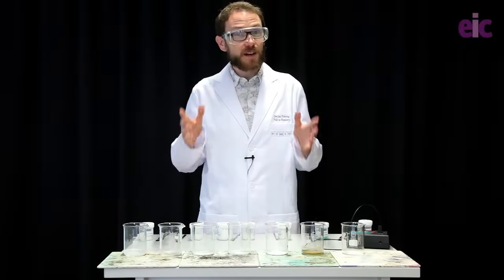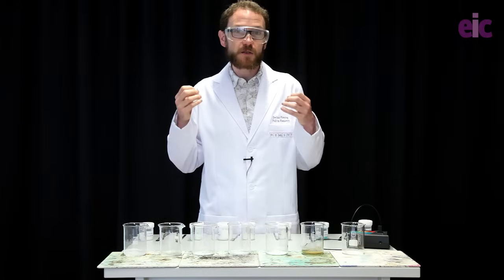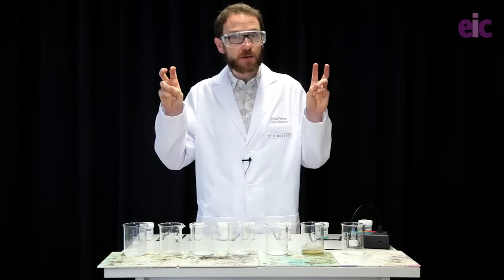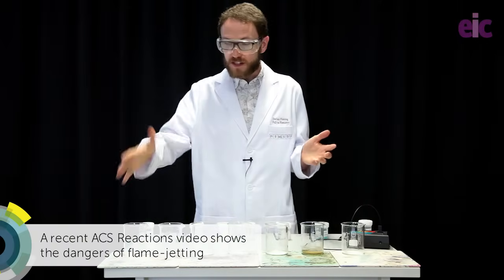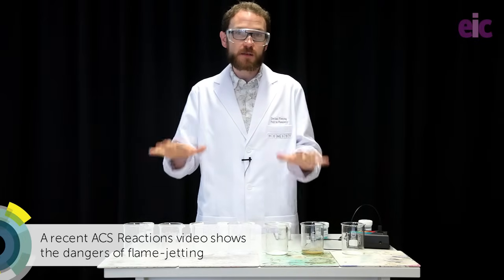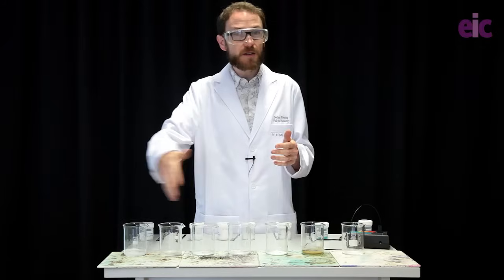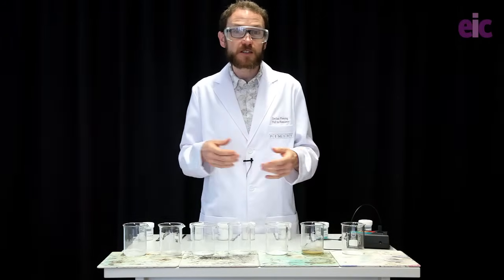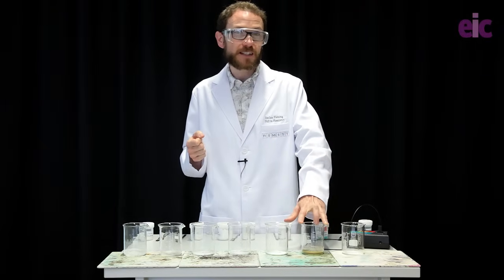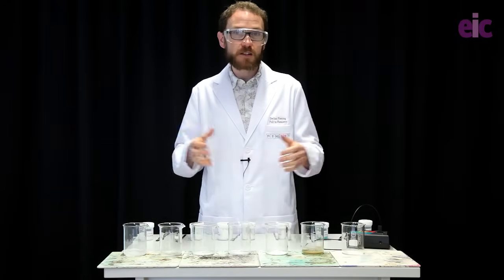Rainbow flames. The main risk associated with this demonstration is when teachers attempt to pour solvent straight back onto a flame they think has extinguished. Potentially it has — but these beakers are going to stay hot for at least 15 minutes afterwards. Make sure you do not ever pour solvent straight back onto these beakers. Leave them 15 minutes or so. If you've done that, these beakers can be kept and reused exactly as they are. It's a really quick and simple demonstration to set up, with the exception of the copper, which will thermally decompose — that one you would collect and dispose of. The other beakers you can keep as they are.